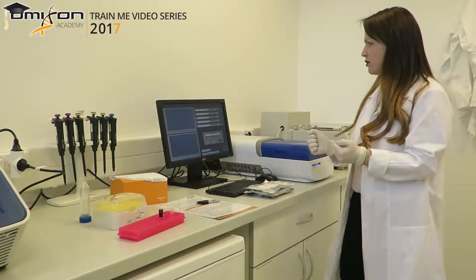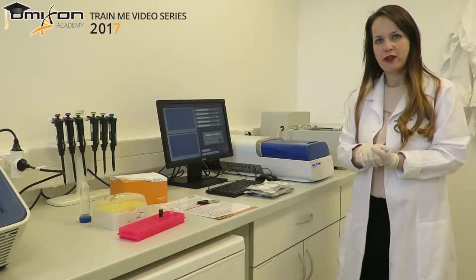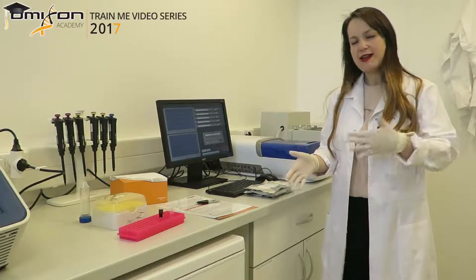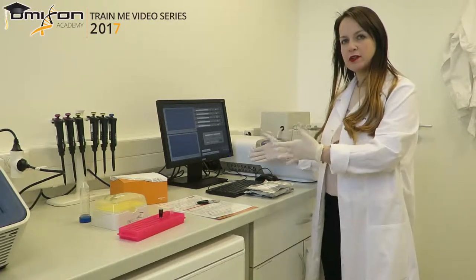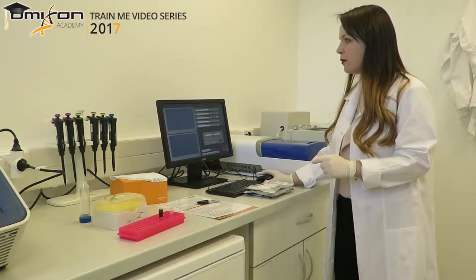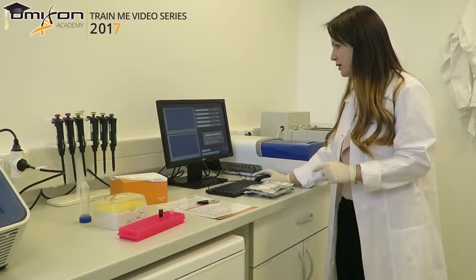You know that it has logged in because you can see multiple tabs at the very top of the software. The next thing we want to do is tell the machine what we want it to select. To set up the protocol, we click on the protocol editor — it is the second tab.